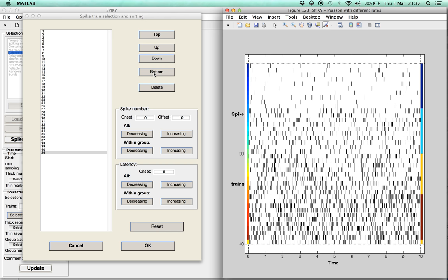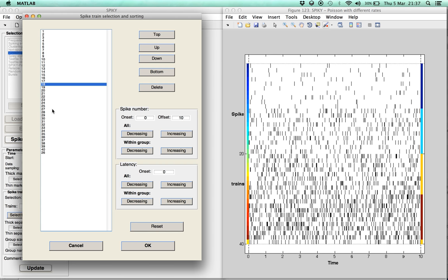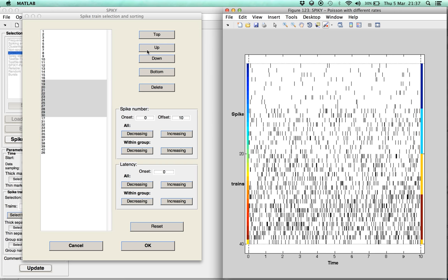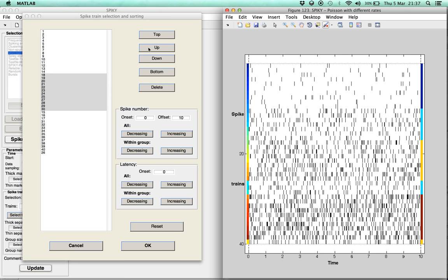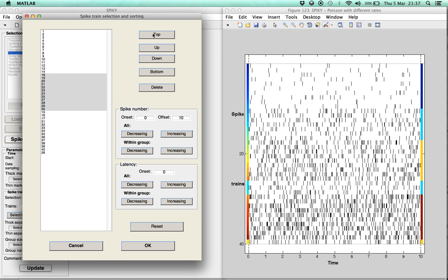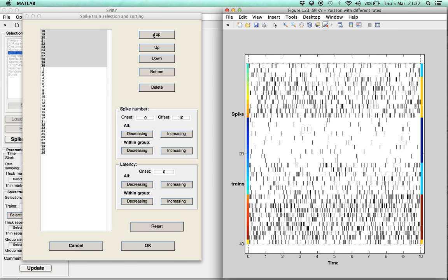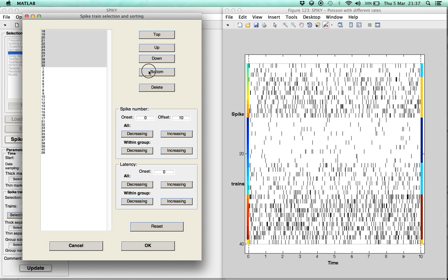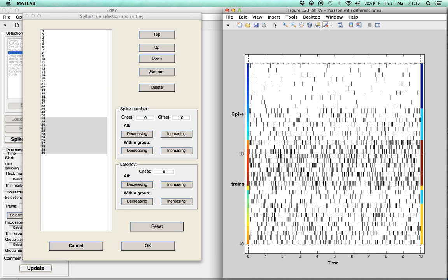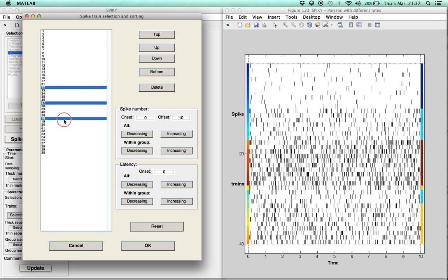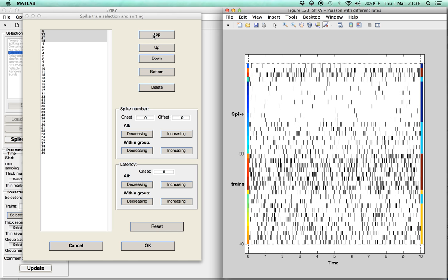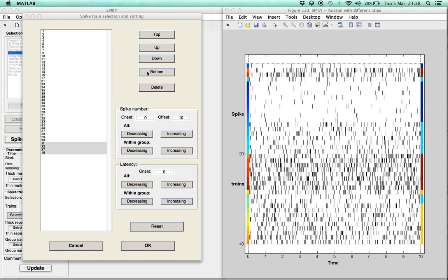The same can also be done for groups of spike trains. The group does not have to be consecutive. For example, it is possible to select a certain number of individual spike trains and move them collectively to the top or the bottom.